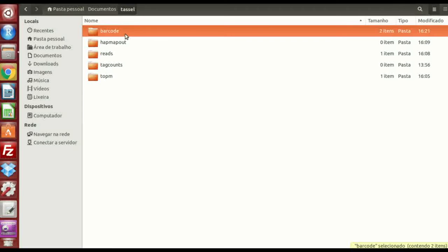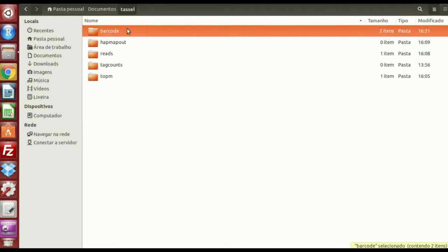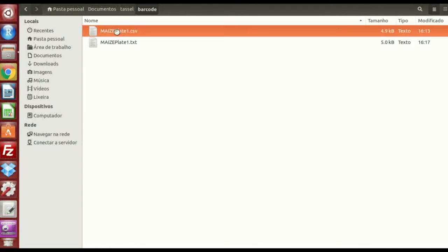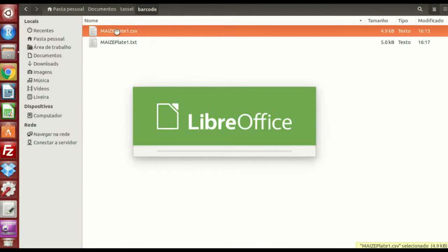So, the first one is the barcode file. I'm not going to enter into details or the theory behind everything I'm going to talk. There are some tutorials on the internet and some lectures from BuckerLab. You can look for that, but the first thing is to look at the barcode file.